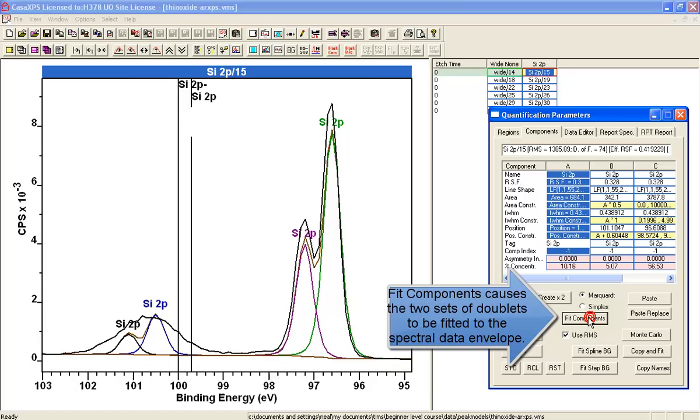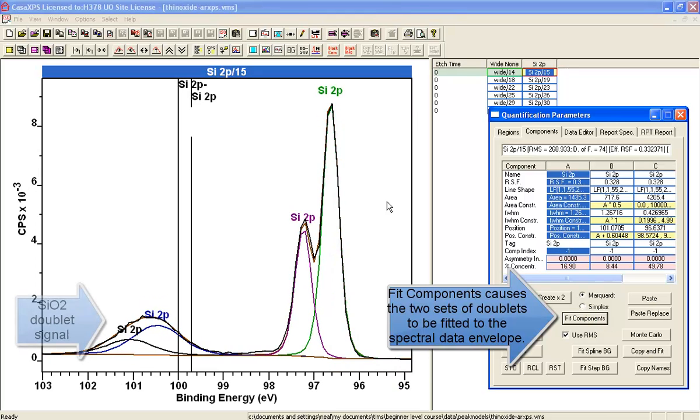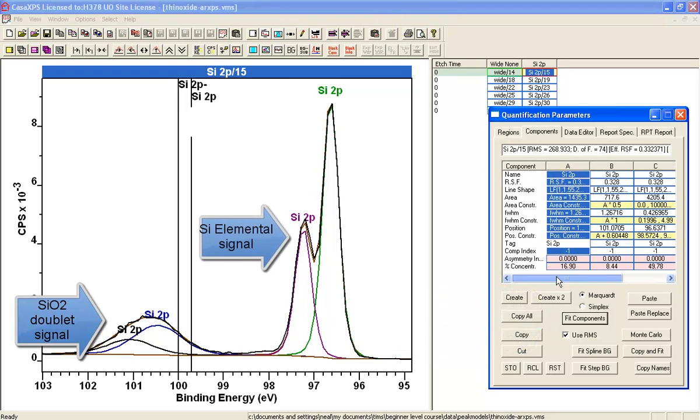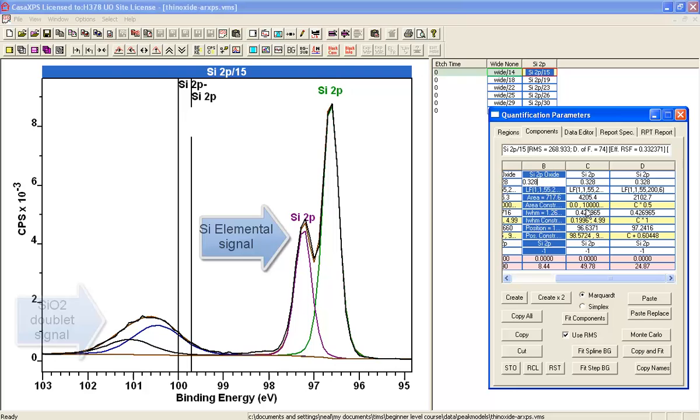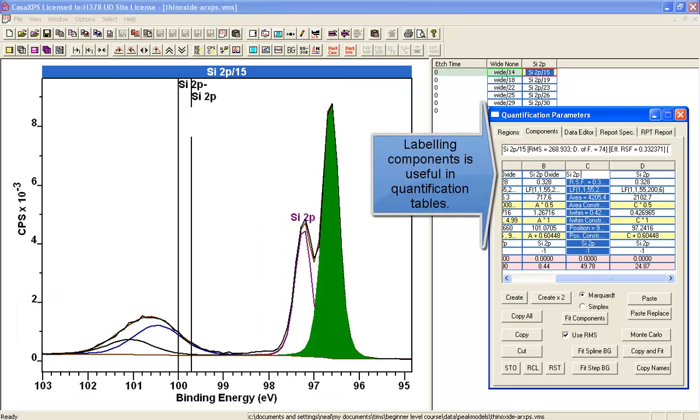Now if I say fit, I've got an oxide here and I've got a metal here or elemental here. So this is my oxide, and I'll give that also the same name, and this is going to be my elemental.